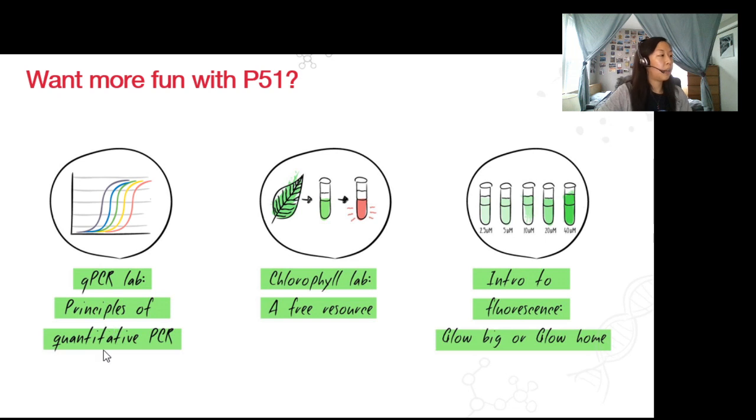So qPCR is quantitative PCR. This is actually the technique that scientists are currently using to test COVID patients. So this is actually a really relevant lab to learn what qPCR is and how it works exactly.